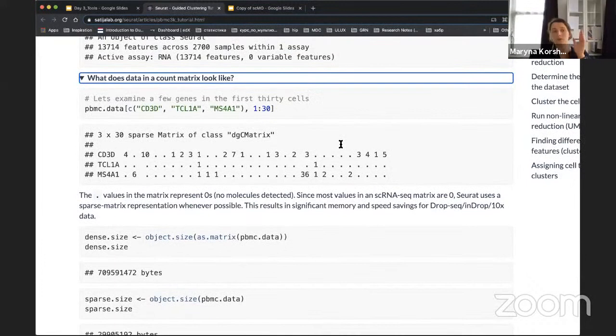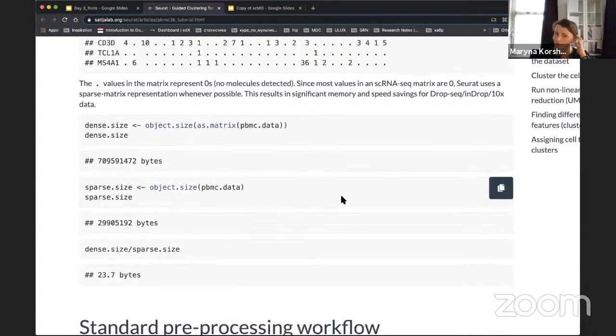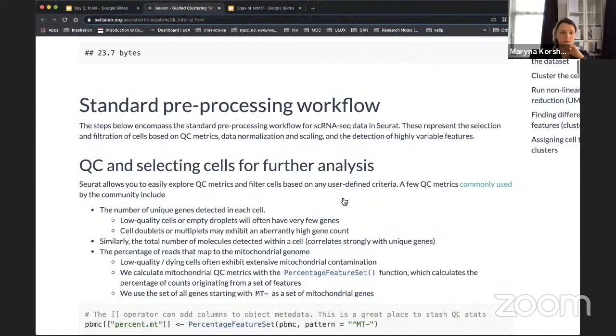But also you can provide just one file if your matrix already has this row with the list with names of genes and cell names as sample IDs. And quite often you already assign the metadata like gender or some experimental condition to these cell names, to the name of the cell. So yeah, let's start with QC then.